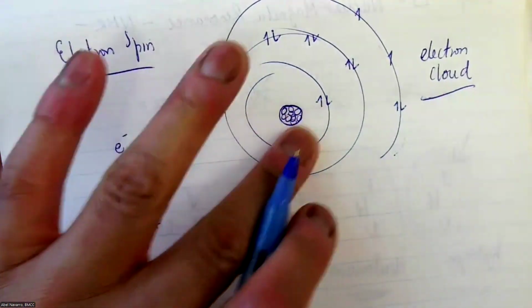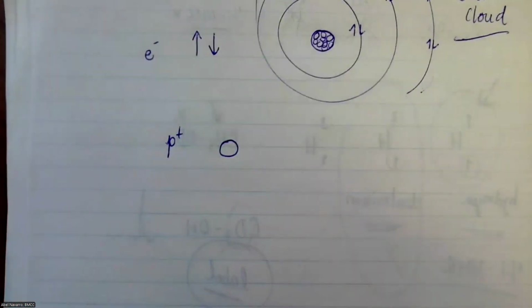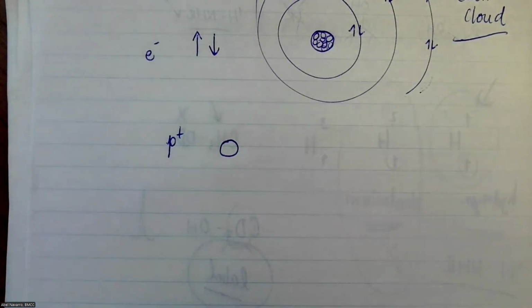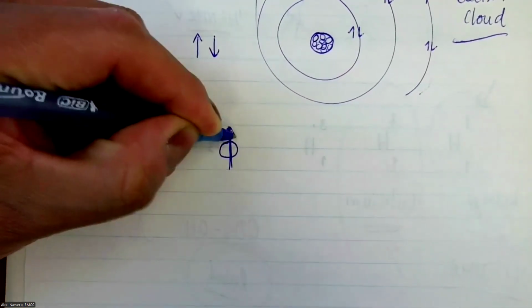The electron cloud, right? There is no nuclear cloud here, but imagine this is a proton. The protons are constantly moving from one side to the other. Since they have a current, remember, for those who have taken physics, every current in motion creates a magnetic field. That's what we also call a nuclear spin.